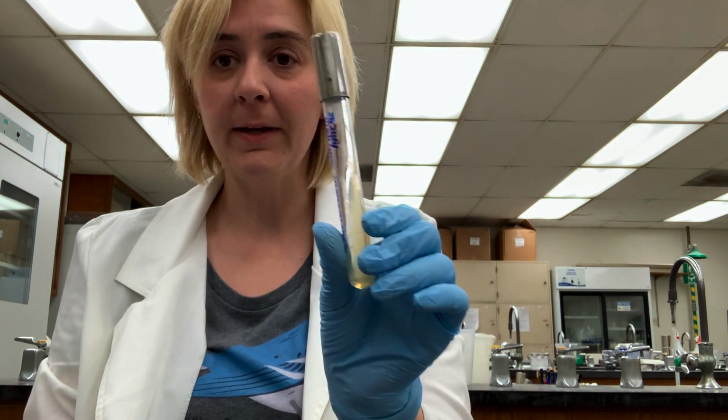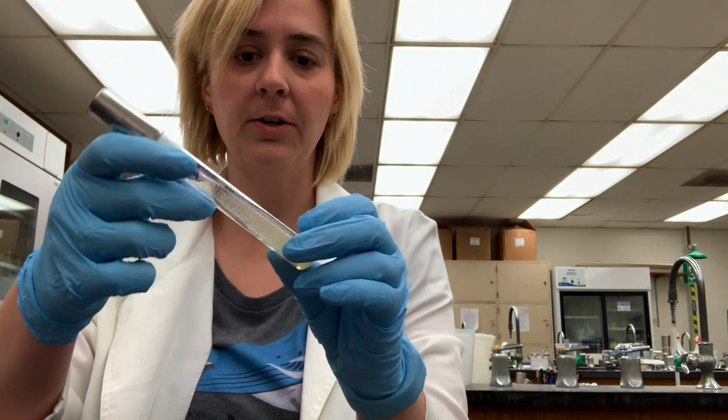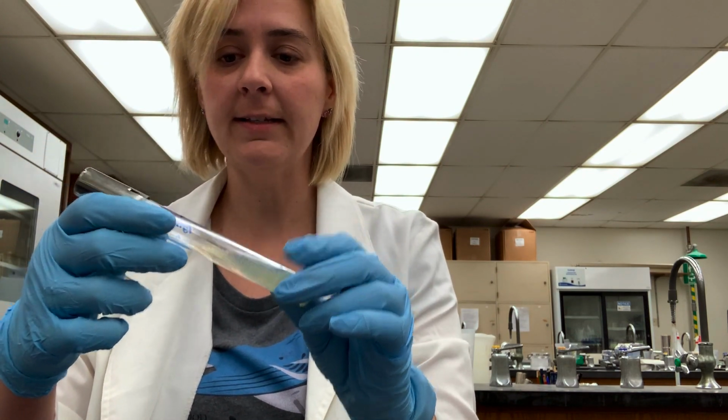While I'm letting my slide air dry, which shouldn't take very long because I spread it out pretty quickly, I'm also going to prepare a slide from an agar culture. When you're preparing from a liquid culture, you just dip your loop into the liquid and spread it across the plate. When you're picking from an agar, you can see here, this is an agar slant. This is Enterococcus.